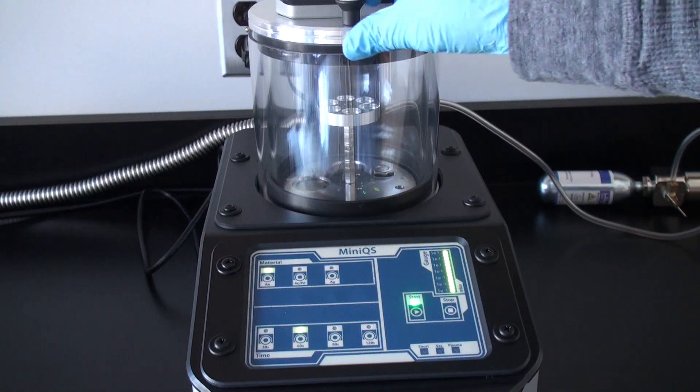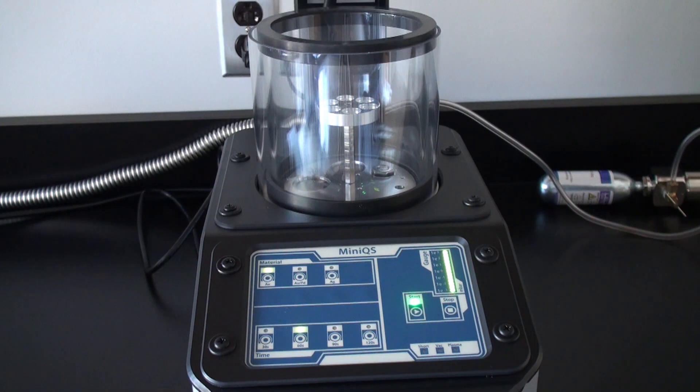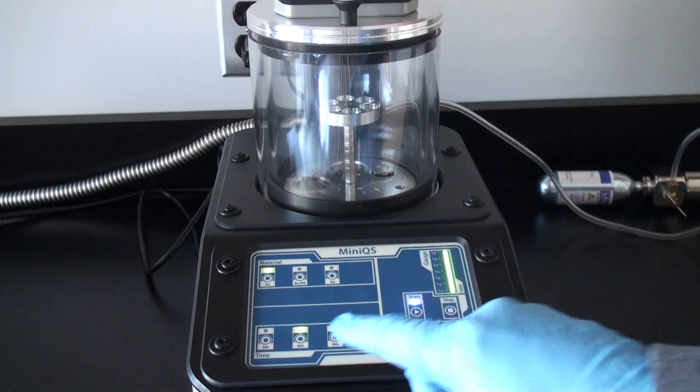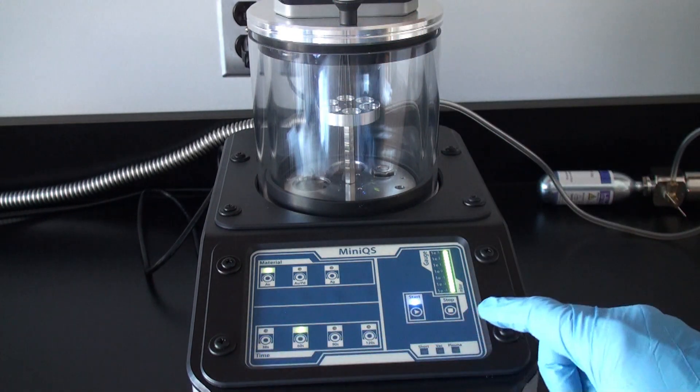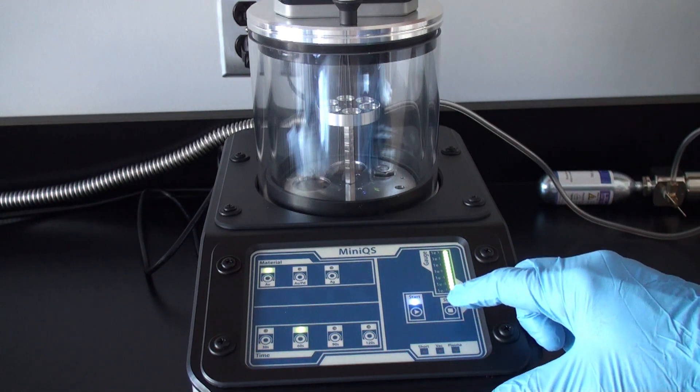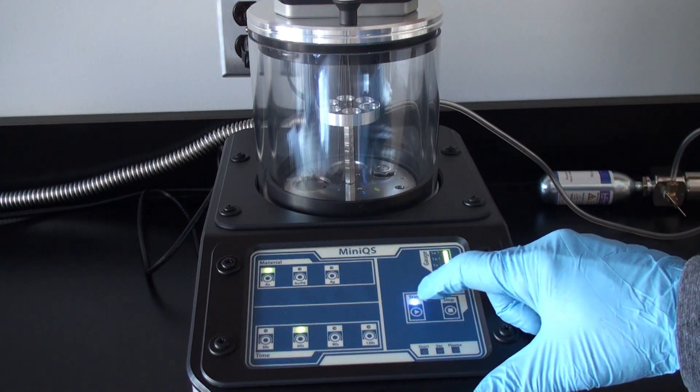Once the target is installed, you can put your samples on the sample stage, close the lid, select the amount of time that you wish to sputter, and simply press start.